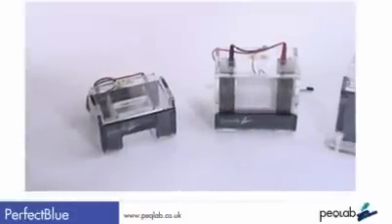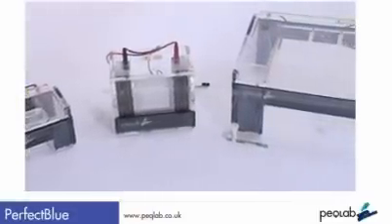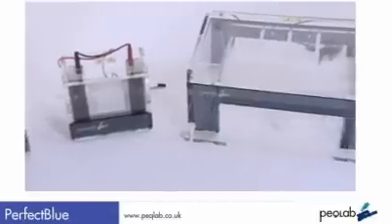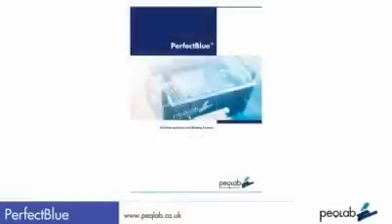In this short video we will see examples of the horizontal electrophoresis system, both mini and maxi sizes, and the vertical double electrophoresis systems. A brochure describing the options and sizes is available from PECLAB.